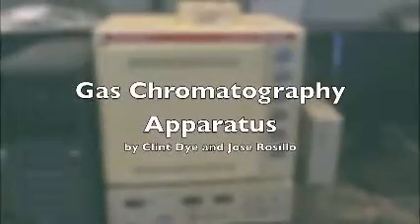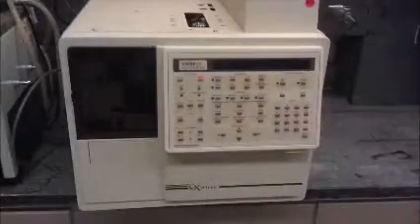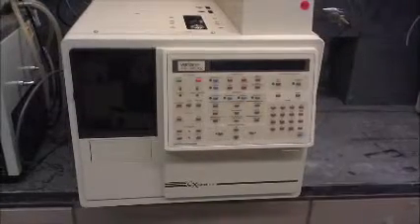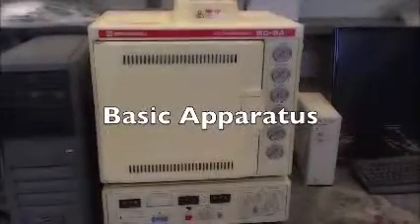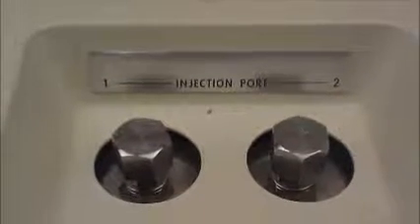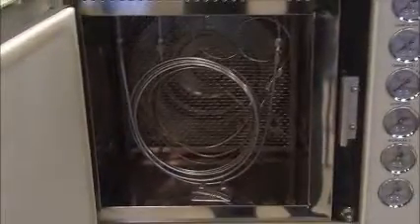Gas chromatography apparatus. Gas chromatography is a relatively fast and simple mechanism used to separate and analyze volatile gaseous compounds. All gas chromatographs share similar components: carrier gas flow controller, an injection port, an oven with a column, and a detector, which may include electrodes and a computer for analysis.